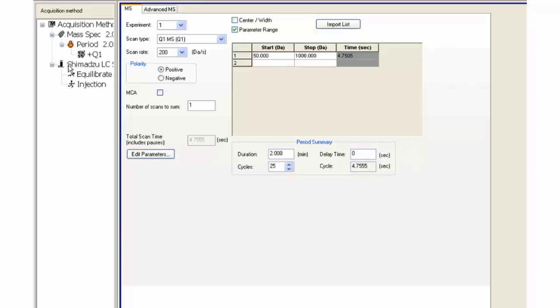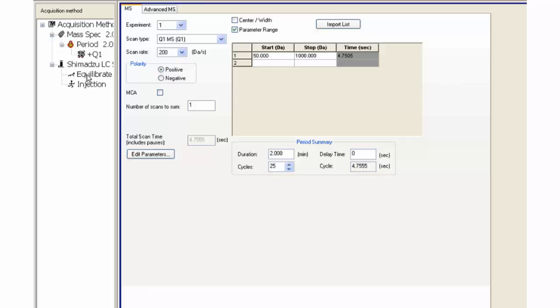Go back to the LC system and click on the Equilibrate option on the left. If desired, add an equilibration time that precedes the LC method.